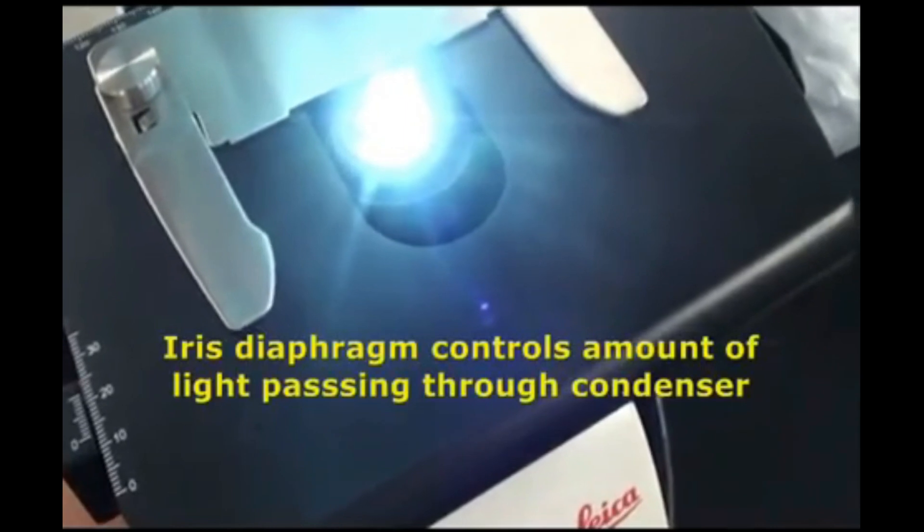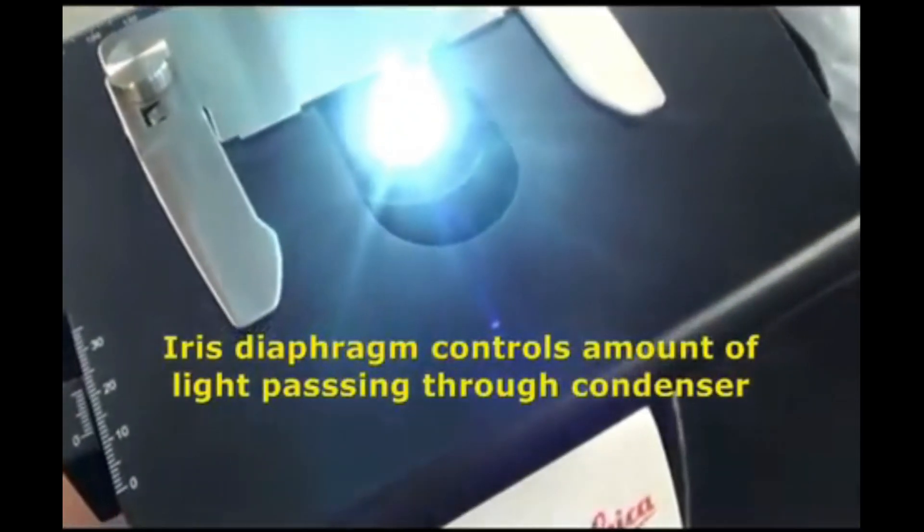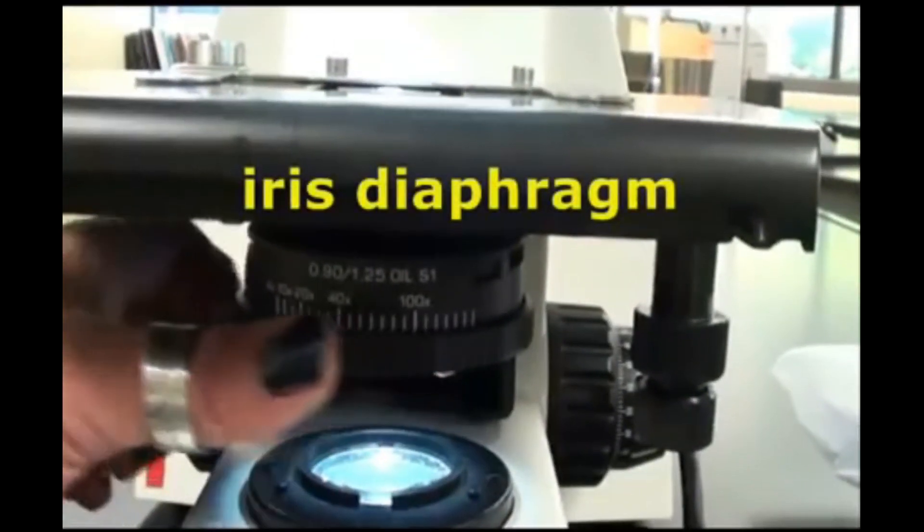Another way that your scope allows you to adjust the amount of light shining up through the specimen is through manipulation of the iris diaphragm. This mechanism is located directly beneath the stage and you twist it to open and close the iris.